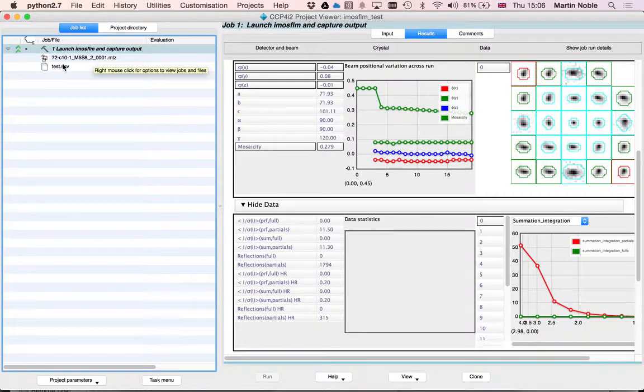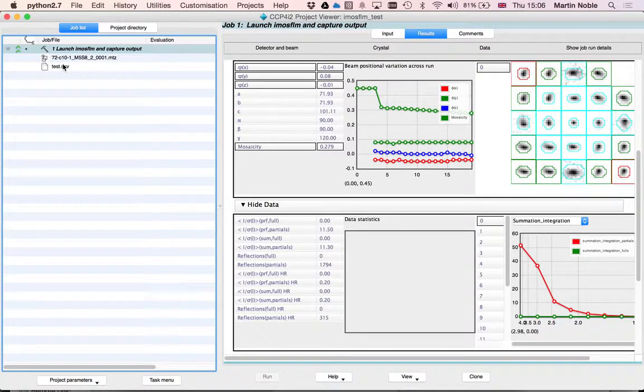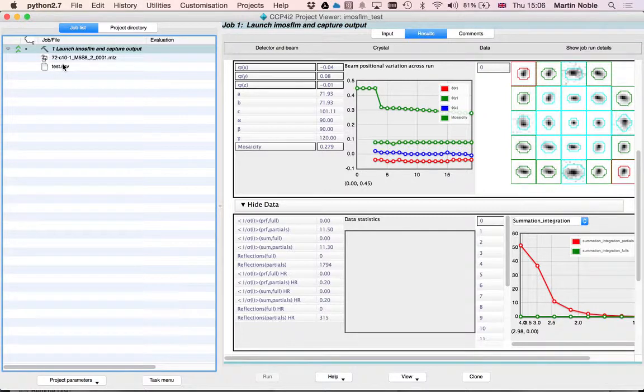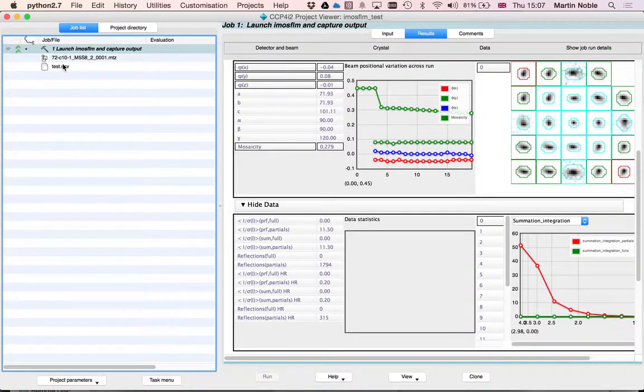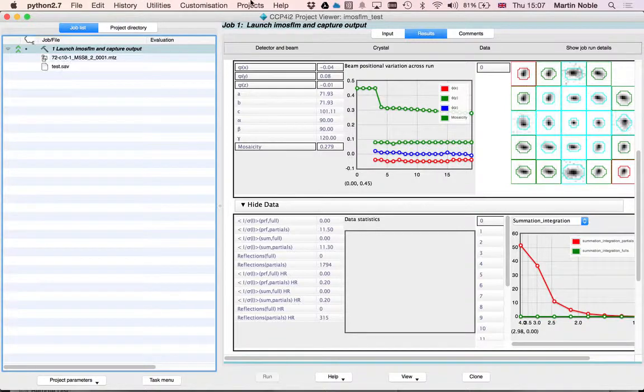It's also captured a save file which will allow you to run another session of iMozFilm starting off from pretty much where you began. So that is iMozFilm in the ccp4i2 interface.